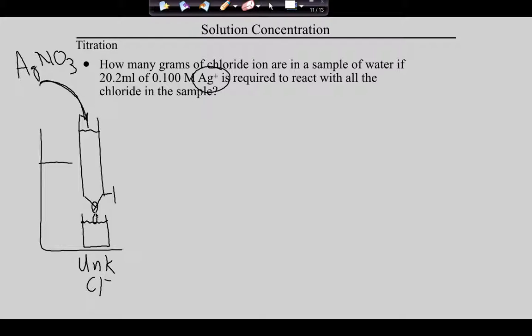A precipitate forms. What will that precipitate be? Silver chloride. What will it look like? What color is it? You just made some in lab, guys. You'd better know this. What color is silver chloride? It is white. So guys, picture it with me. Every time a drop of silver nitrate hits the solution, you're going to see white and white and white.